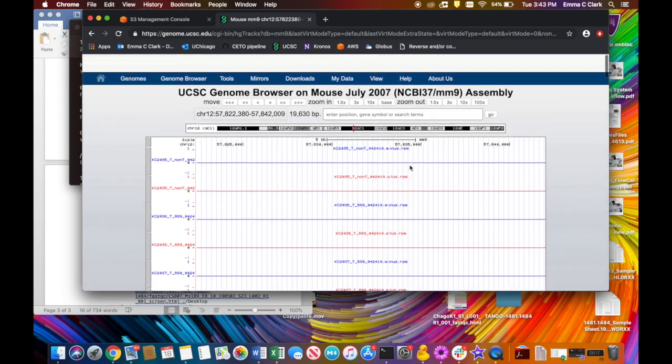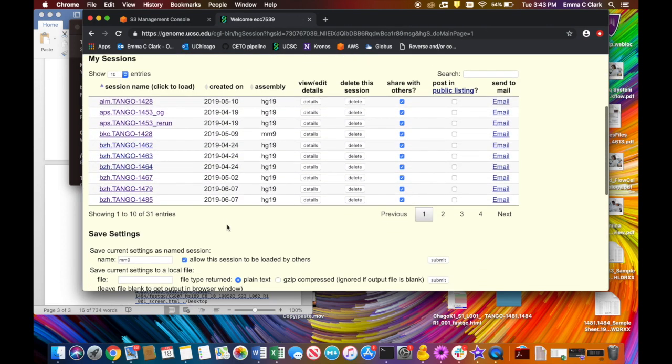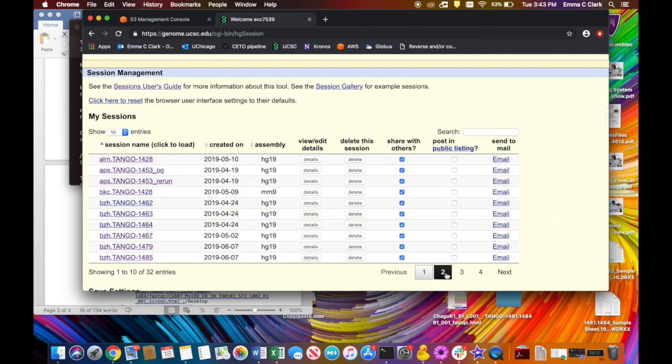So then you will want to save this, so you'll say My Sessions, and you look down, and where it says MM9, you're going to change that to the person's initials, and then the Tango number. So 86, and then submit. And so now you have that there.